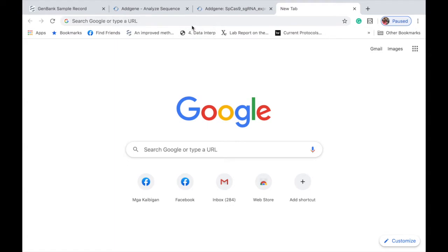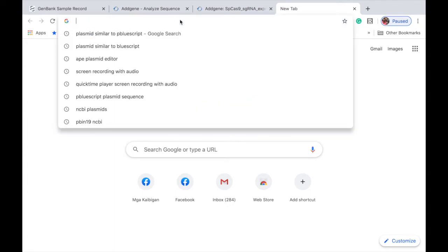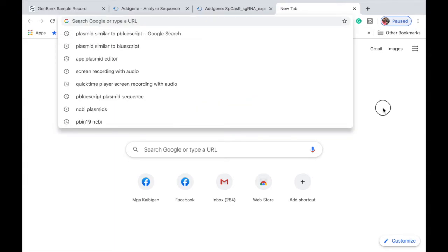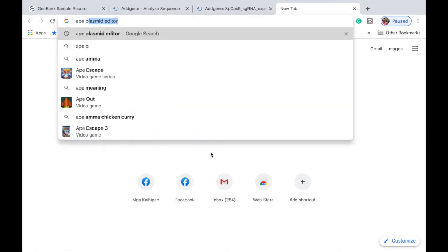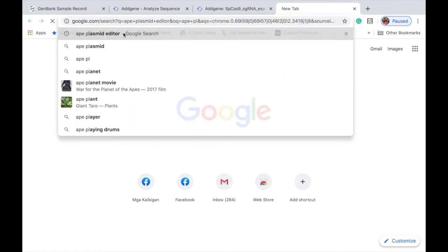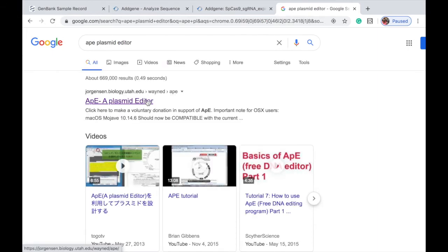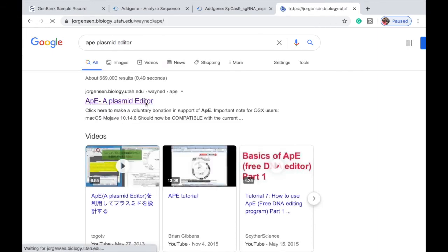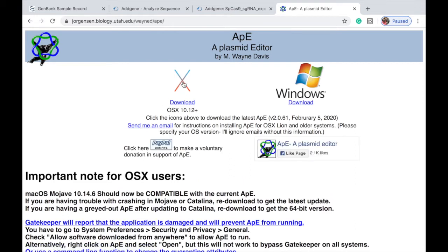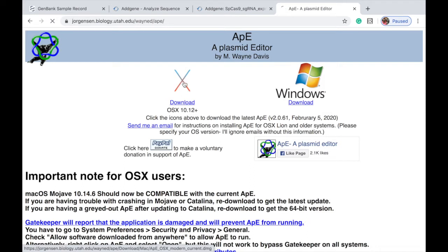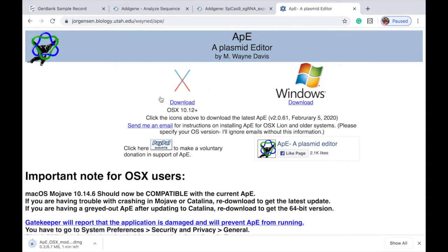I personally like this software compared to other sequence editors because it's really very easy to use. You can paste the sequence and use many features such as aligning sequences, looking at enzymes, and digesting a portion of your DNA. To get started, open your browser — for example Google Chrome — and type 'ApE plasmid editor'. If you are using a Mac you click one download link, and if you're using Windows you click the other. I use a Mac so I will download this software and wait for it to finish.